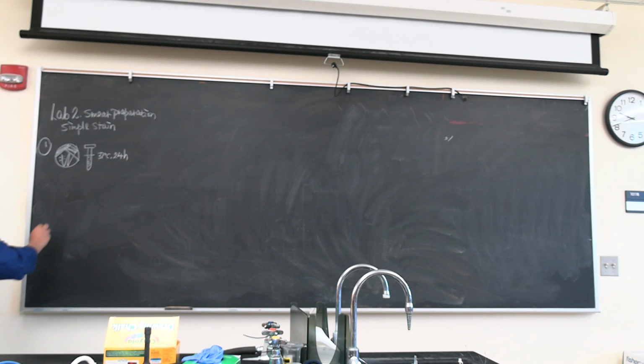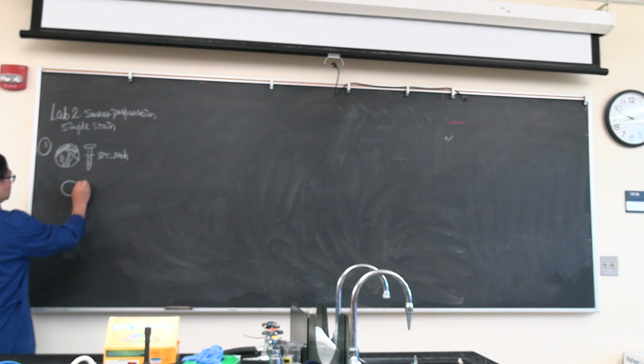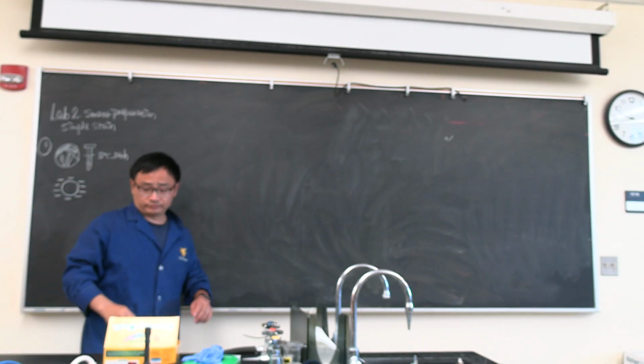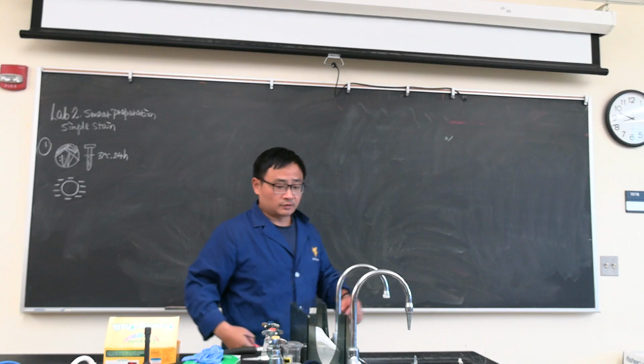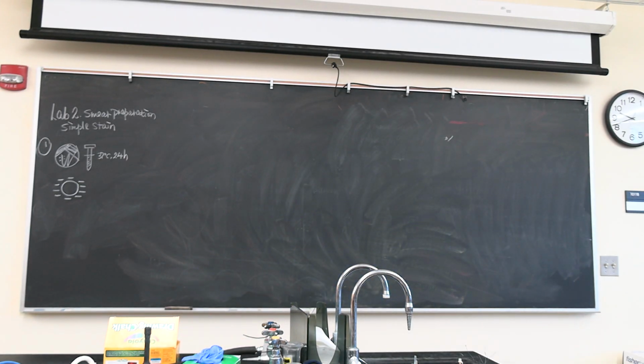The bacterial cell culture, let's say like this, is negatively charged. And then all those dyes, where are the dyes? They are basically on the side of your box.